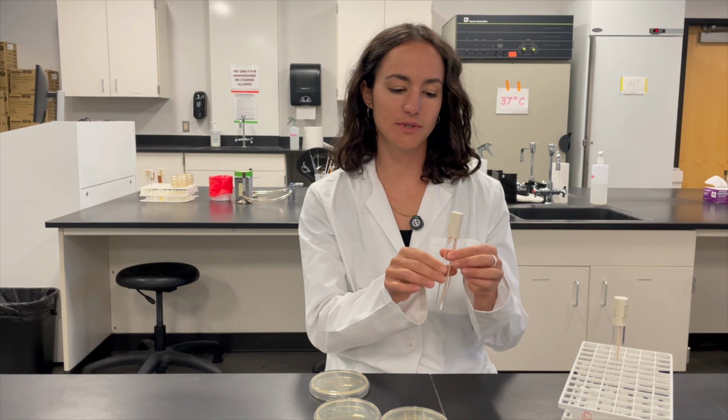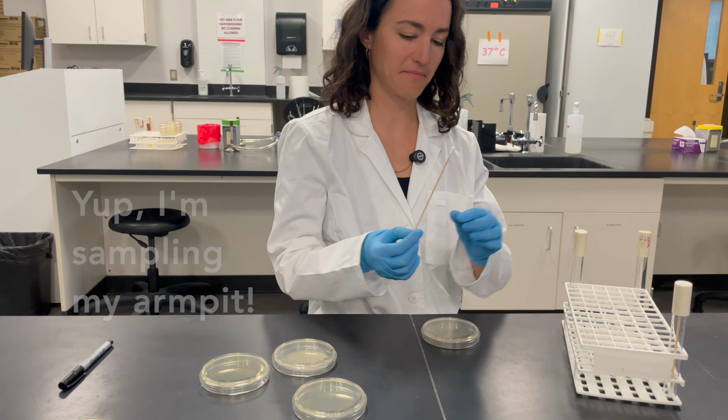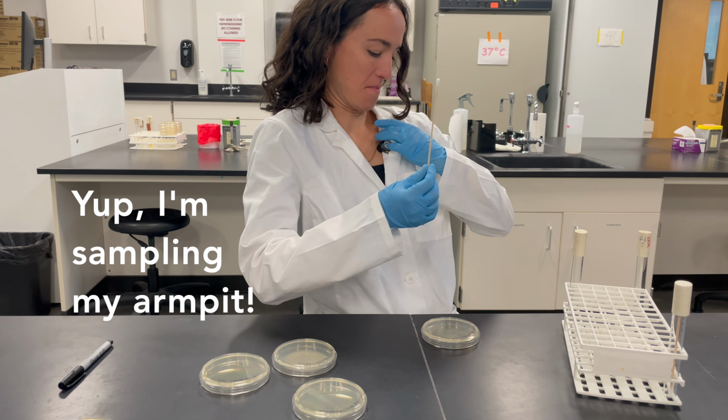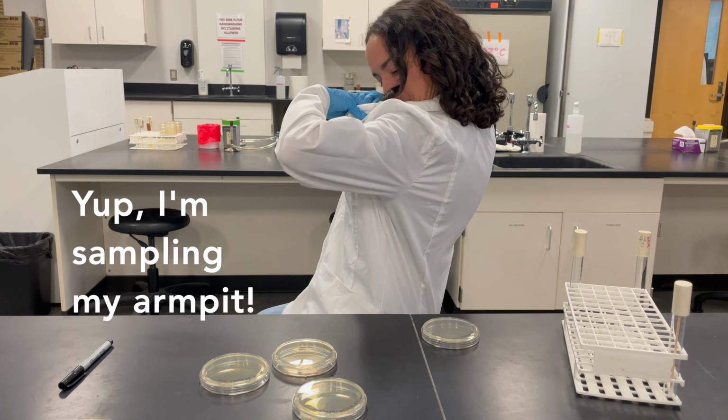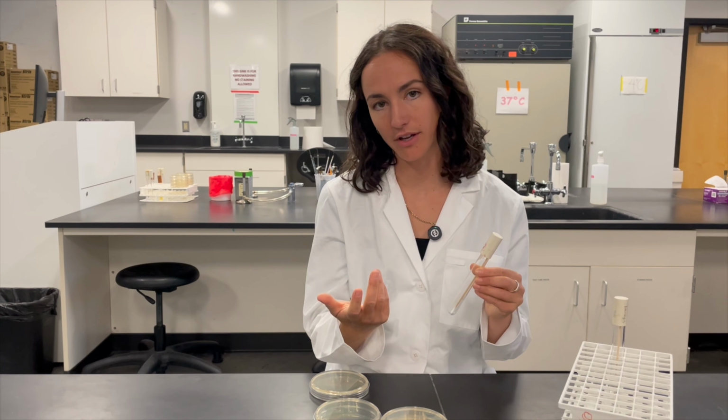We'll also use some sterile swabs. So these swabs have been autoclaved, meaning they've basically been pressurized at high temperatures, and everything inside of this vial should be sterile. So these swabs will help us sample our environment.